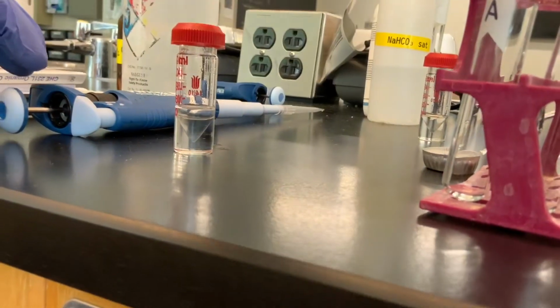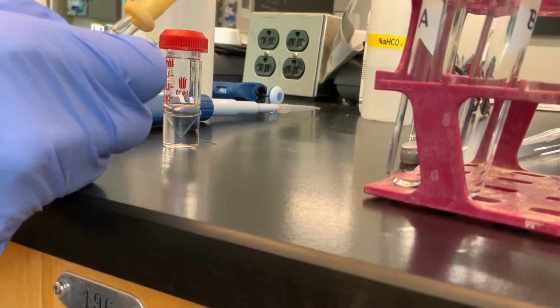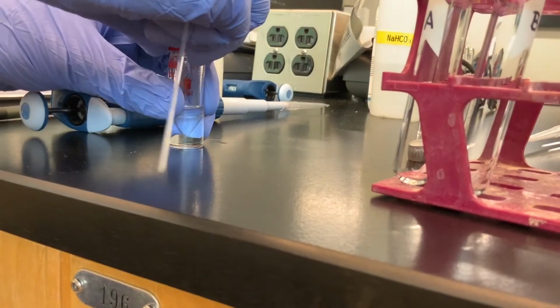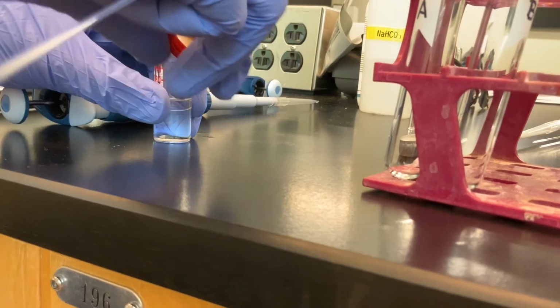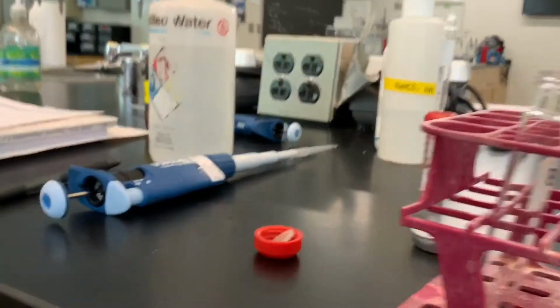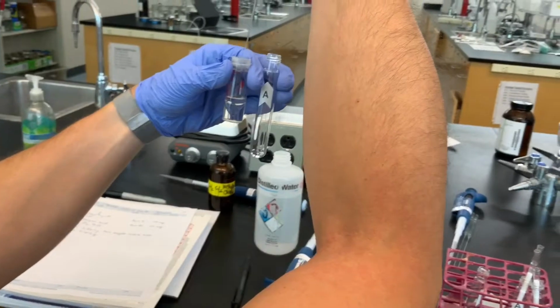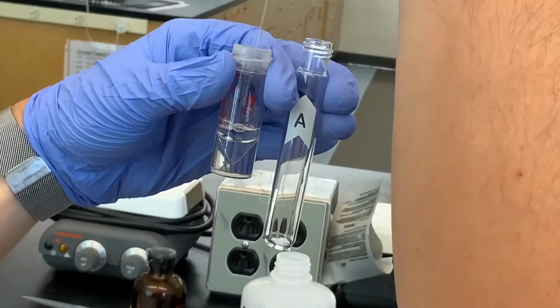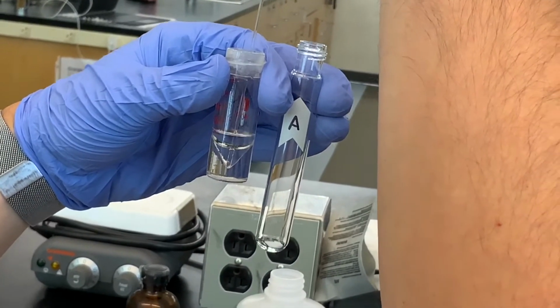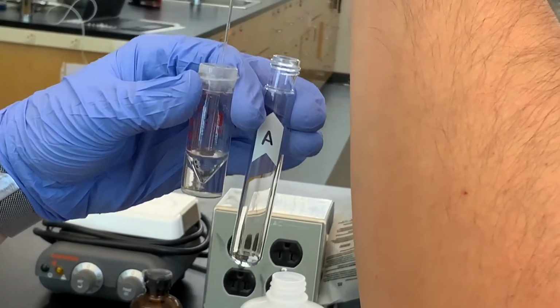So to tube A, very carefully, I like to, if you're ambidextrous enough, hold the two next to each other, and I've got the bottom of my Pasteur pipette drawing up just the organic layer.